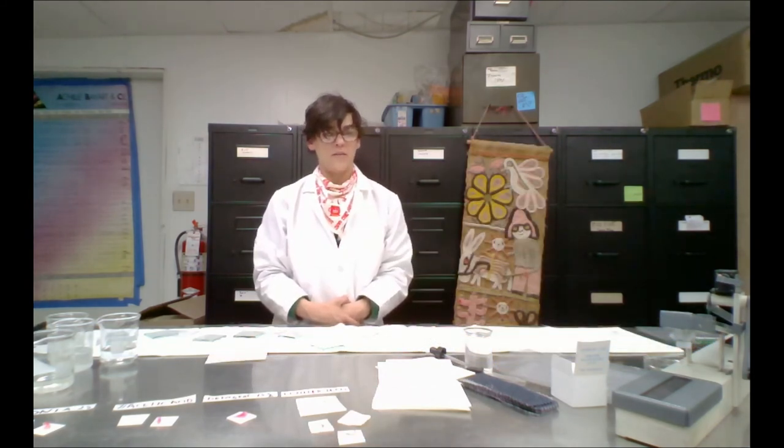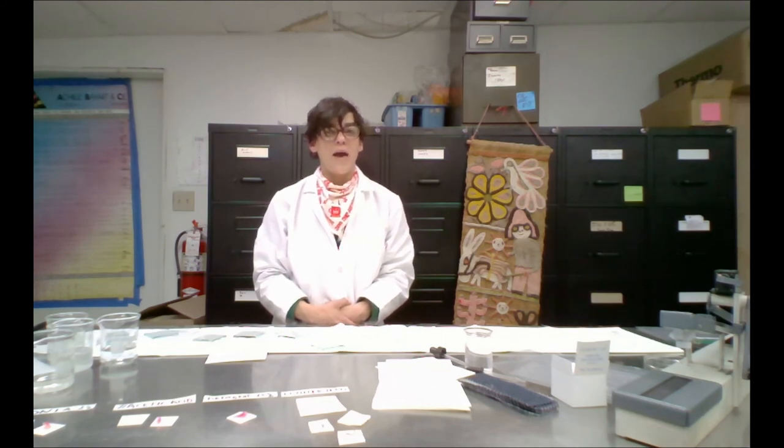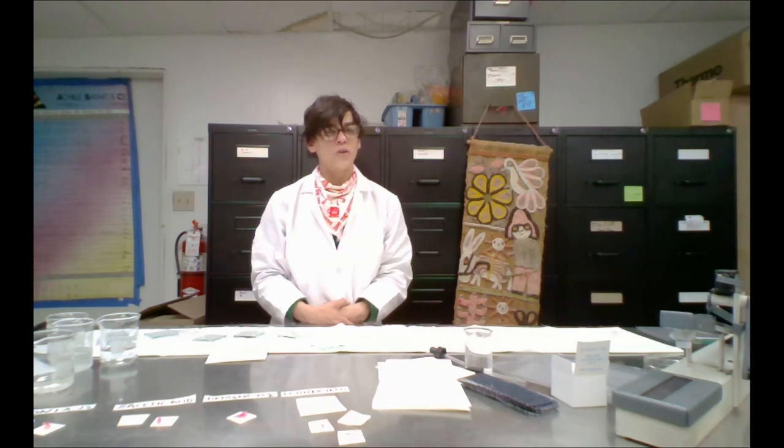This is the basic method for colorfastness. AIC lists variations on the basic method and they also outlined three alternative test methods for wet cleaning.